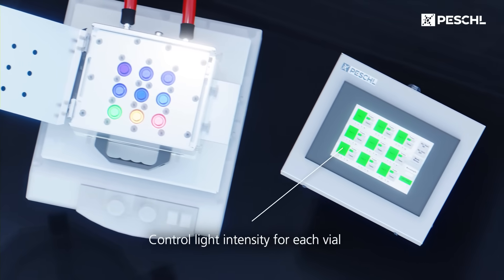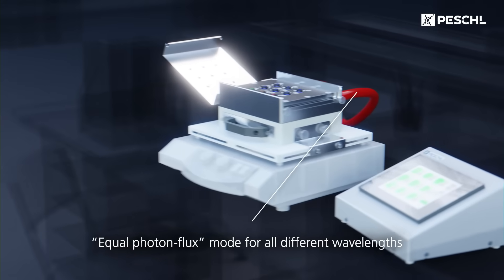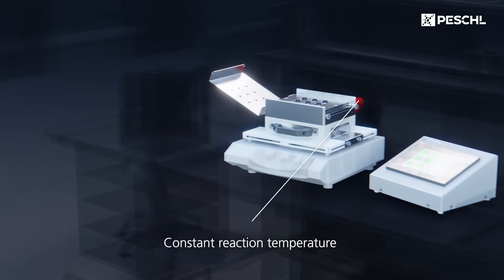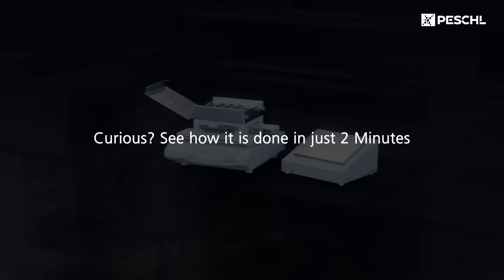Control the light intensity precisely for each vial. For correct comparability, choose the equal photon flux mode for all different wavelengths, regardless of LED efficiency. The reaction temperature can be maintained constant over a long period of time.